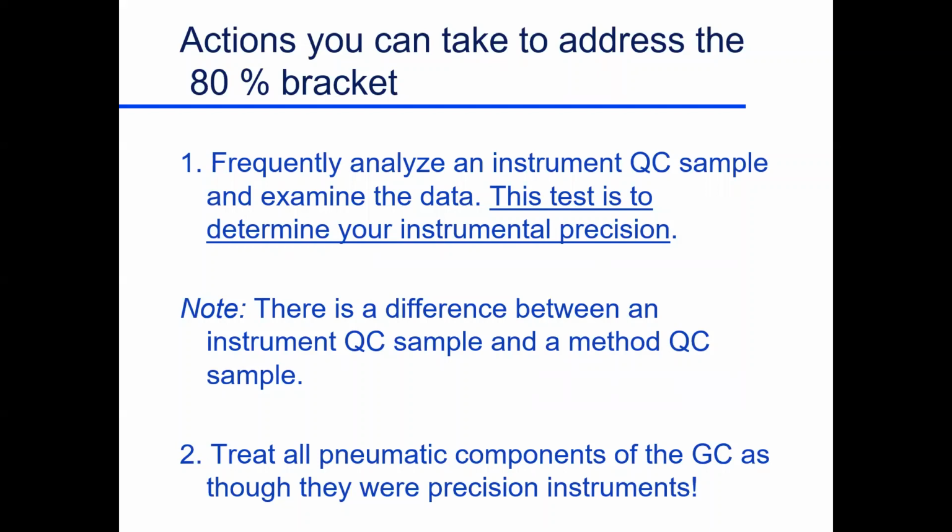And so you start looking for those standards, those compounds you injected. Is your peak this big today? And it was that big before? So again, you simply put in standards, known compounds, and see is the instrument doing what it should. If it's not, then obviously you start taking a look at what was done wrong.